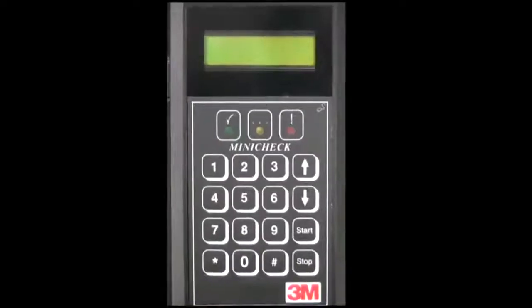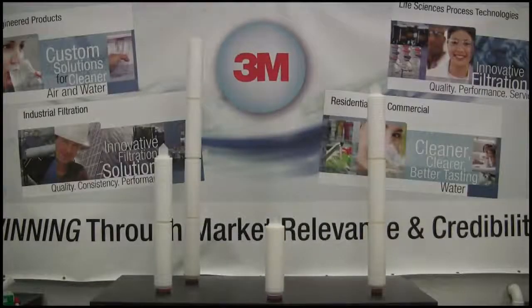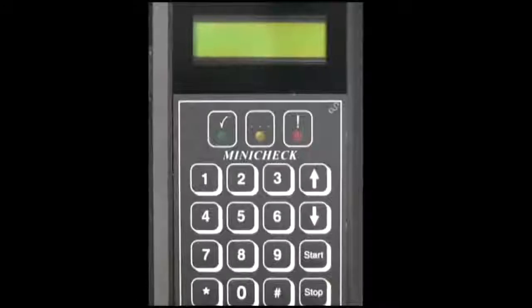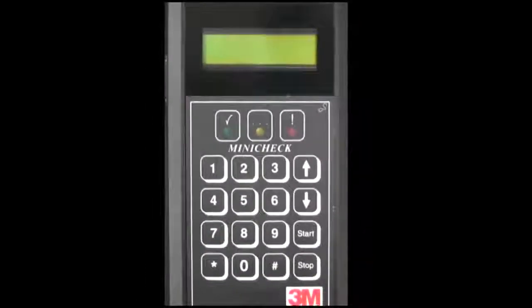The 3M Series 100 Automated Integrity Test device is utilized to determine the integrity of any membrane filter configuration. The device can fit in the palm of your hand and allows for up to 19 different test protocols to be programmed.